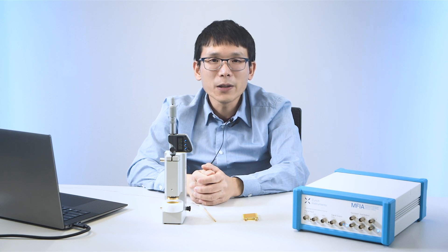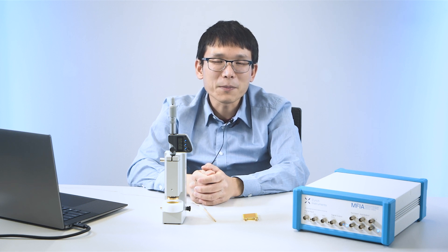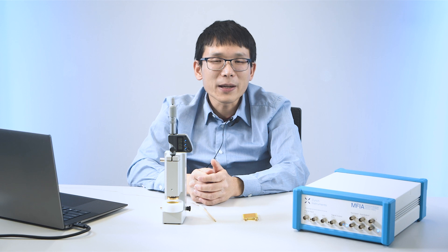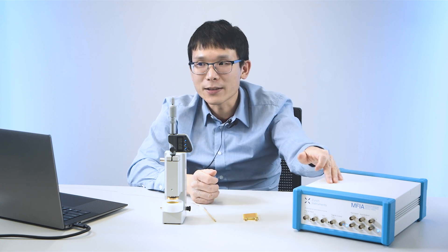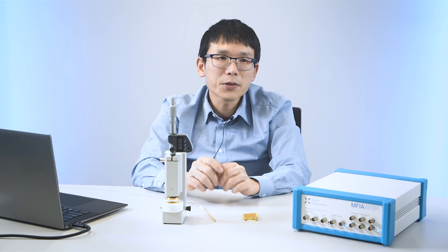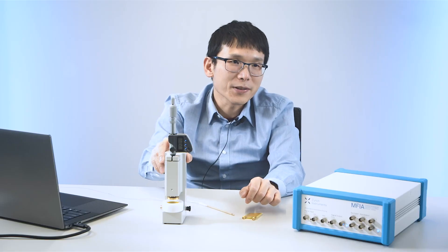In this video, we are going to present three different measurement scenarios. All these applications will be covered by an MFIA impedance analyzer, a laptop, and third-party electrodes, probes, or dielectric fixtures.